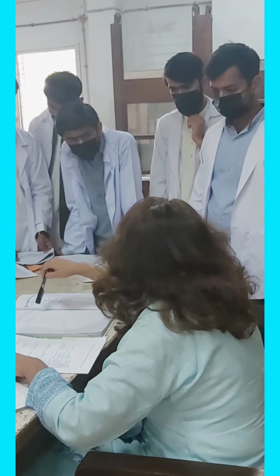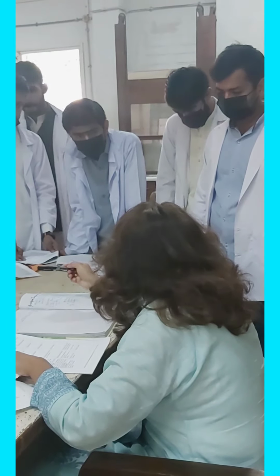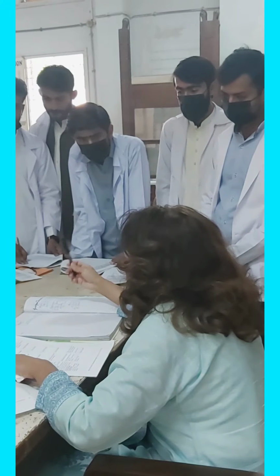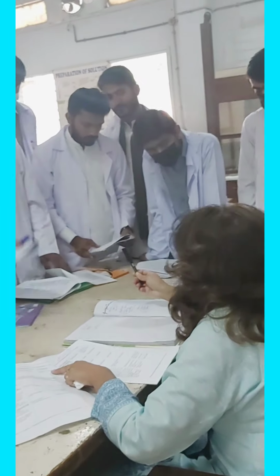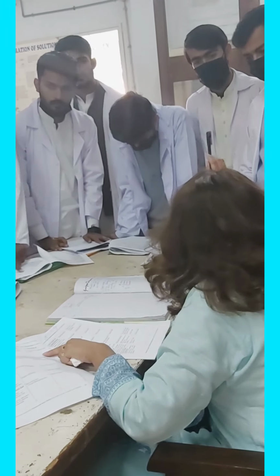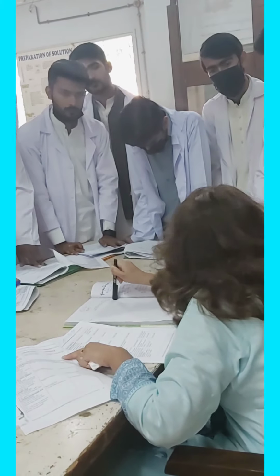So how did you say that it is present? And we will do it. How? Are you sleeping? No. Then why can't you figure it out? I have repeated it so many times. Do the carboxylic test. Okay, so we will not do the aldehyde test, and why? You should have a valid answer. It's a known compound and it doesn't contain an aldehyde or ketone.